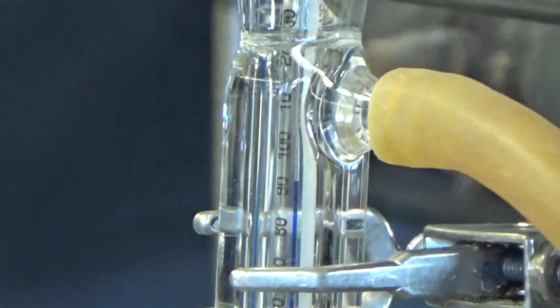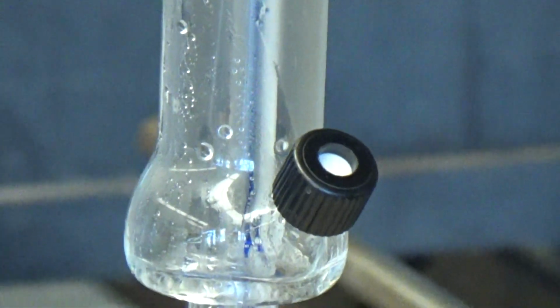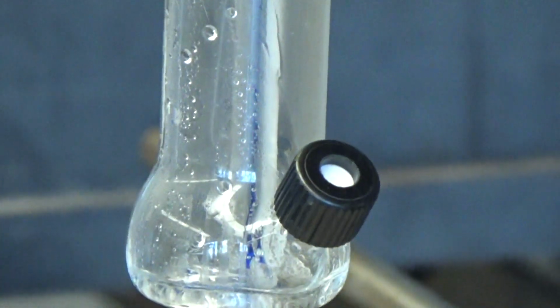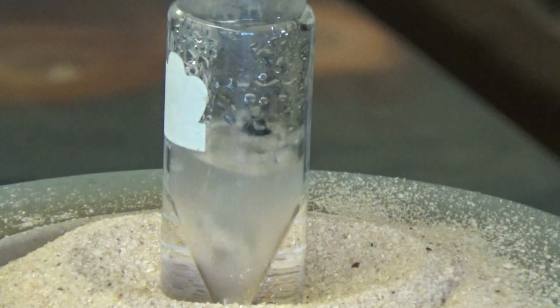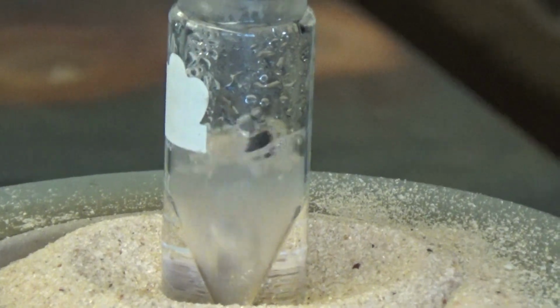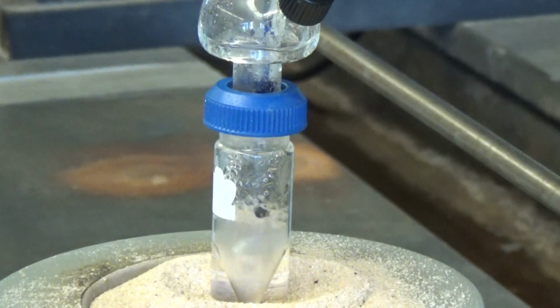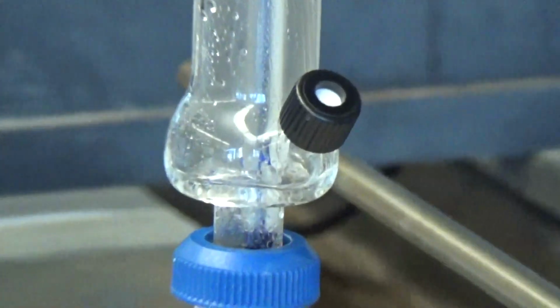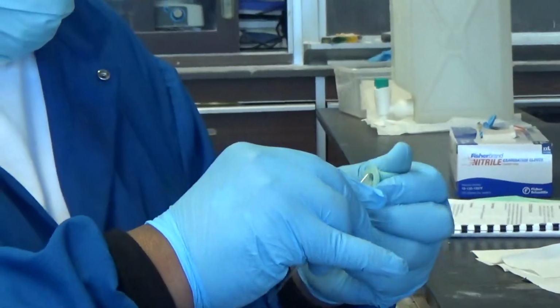What's our temperature now? It's 90-something, 92. The reaction is working, it's great. But to get that, maybe you get it from the syringe. These syringes are too small. So you're getting a syringe ready to suck it up, or what's the syringe for? I will use a Pasteur pipette. That'll work, better. That's to suck up the product out the little port, the portal.